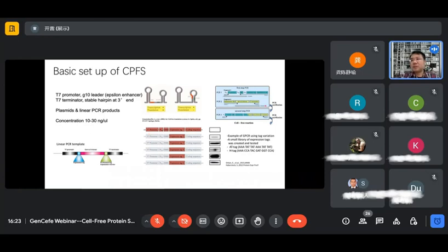And this can be achieved simply by standard laboratory techniques like two-round PCR, where you include your promoter in the first round of PCR, and of course the gene of interest, and then you amplify the whole cassette again from your PCR template. And this is an example of how we would vary the 5' sequence of a target protein that would not express with its native sequence.